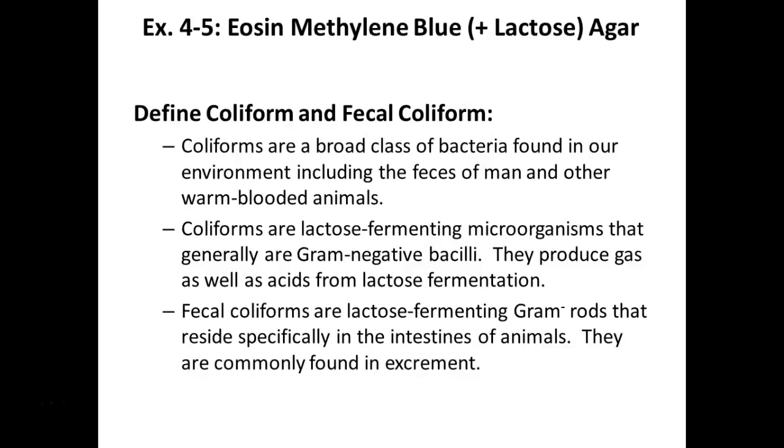Why do scientists use this media? Typically they're looking at coliforms and specifically maybe fecal coliforms. They basically want to know, did poop get in their sample? This is what you're waiting for whenever we have a boil water advisory. For some scientists to plate out stuff and see if it grows on plates like this. Of course, we don't want to see any growth on these plates, right? Because that means that poop got into our drinking water.